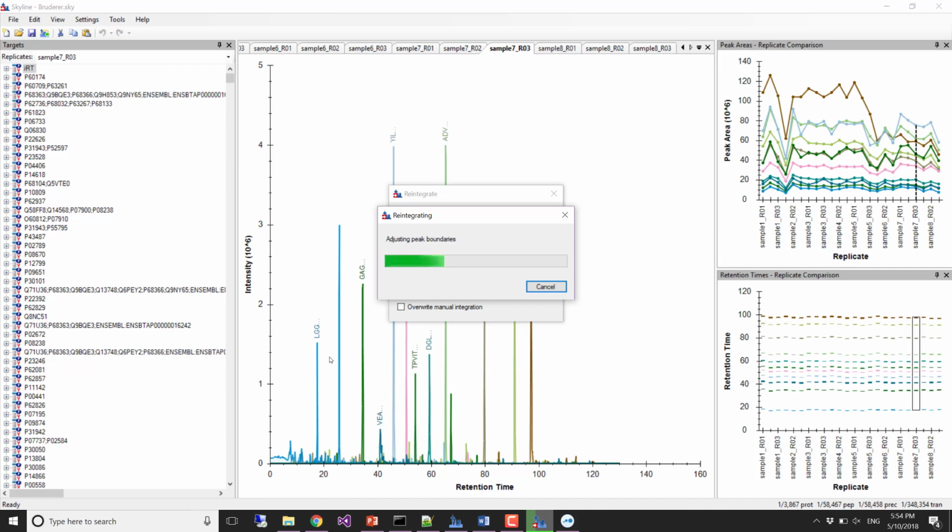Most of the tools will deal with the Q values. So Skyline is marking everything with Q values. If you choose that, take only Q values, only peaks, what it's going to do is zero out a whole bunch of peaks. So they're going to turn into NAs.